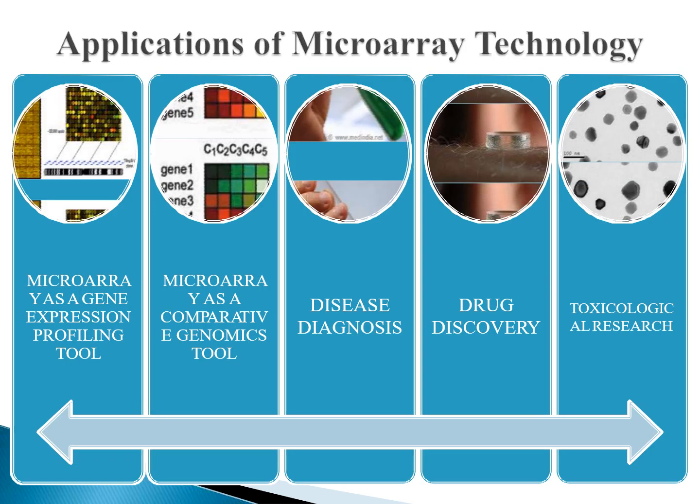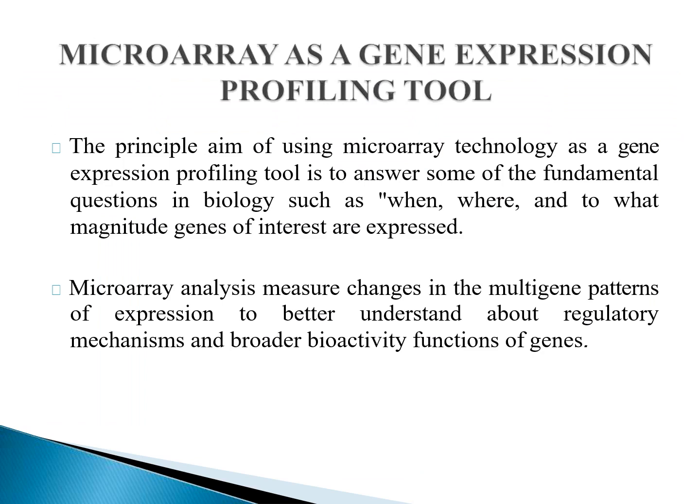Then applications of microarray technology. Now, there are several applications of DNA microarray technology. A few of them are that it can be used as a gene expression profiling tool, or as a comparative genomics tool, or for disease diagnosis, for drug discovery, for toxicological research, etc. So the first application is microarray as a gene expression profiling tool.